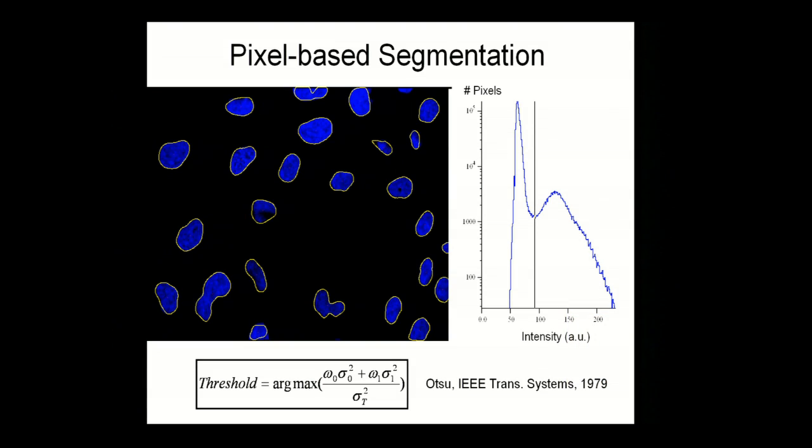So what is used now are different modifications of the Otsu approach. They just change the function to maximize or minimize to divide the intensity into classes. So you divide the intensity into classes and say, this is background, this is foreground, find the boundary, apply maybe some morphological transformation to find the topologically connected areas, and this is your data. Maybe later apply an additional filter to remove something or find something more specific, or something that does not fit the idea of what could be nuclei.